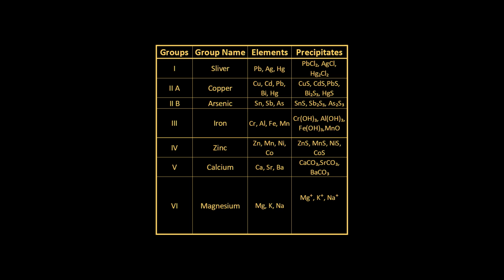This table is a summarization of the group separation schema. The group classifications are based on the formation of chlorides, sulfides, hydroxides, carbonates, and finally metallic ions left in solution. Chlorides are insoluble in cold hydrochloric acid. Adding hydrogen sulfide gas adds sulfur to the solution. The group 2 elements are insoluble in solutions as they form sulfide molecules. Adding hydroxide and additional chloride in the form of ammonium compounds to the solution allows the formation of the group 3 compounds, which are insoluble as hydroxides. The rest will be soluble in a chlorinated solution.